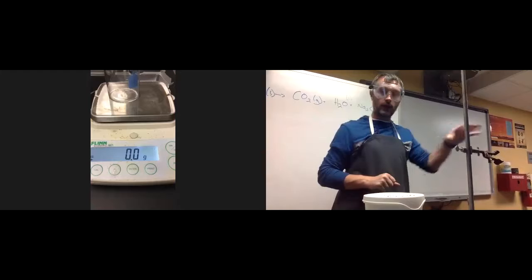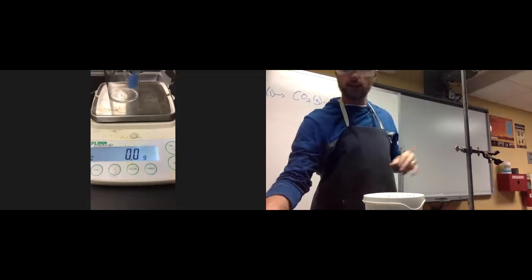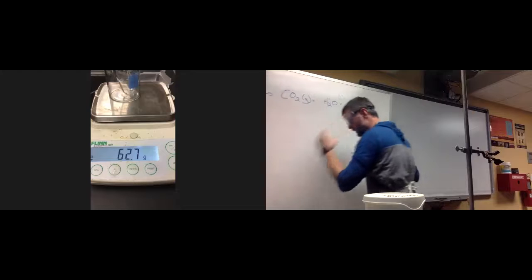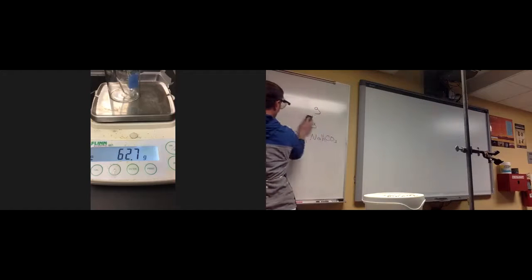I'm going to do a stoichiometry lab today. So I've got a second camera set up on the balance. I've got a beaker set there because we're going to run our samples today with a test tube. So we're going to be able to mass both the test tube and the sample. I've got two boards I'm operating from. So I'm not sure what this is going to work out to be.